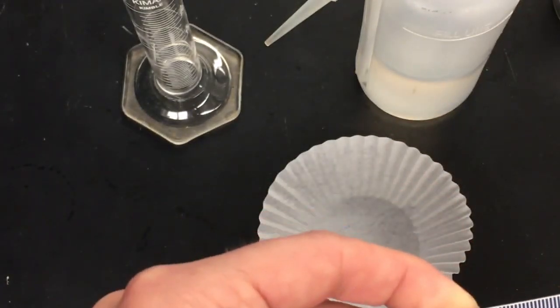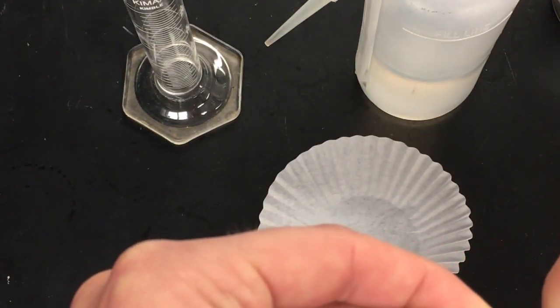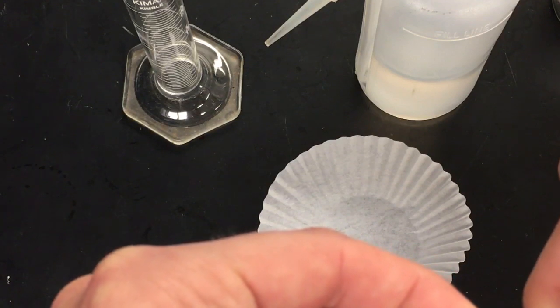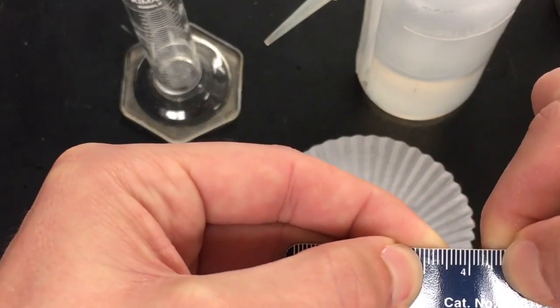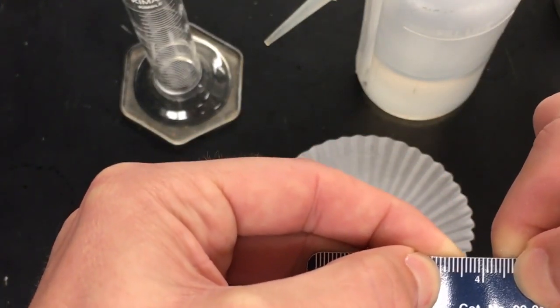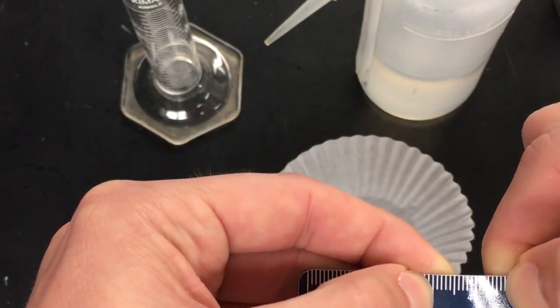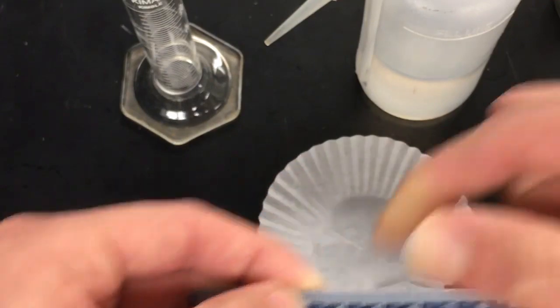So if that is my 0, it goes to 1, 2, 3, it goes to there. So that would be about 1.7 centimeters. Now you notice how I said it was about exactly on the line?